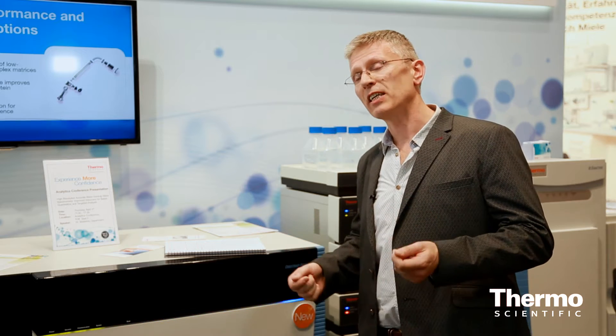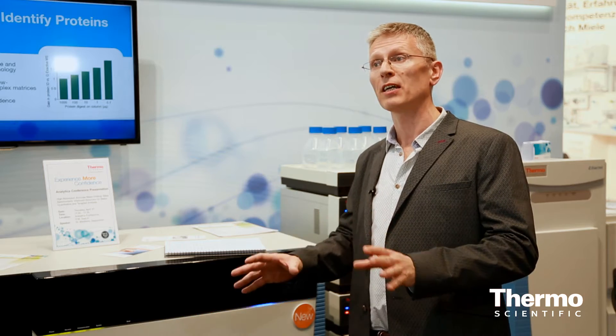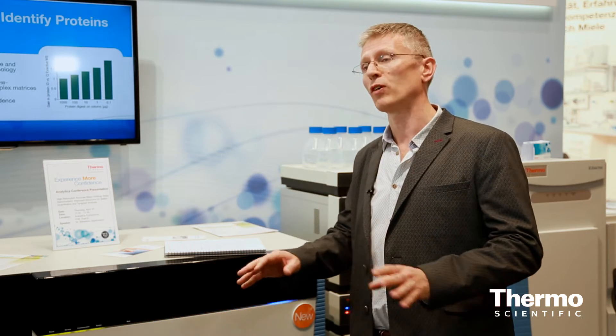It has ETD, HCD, and CID. This combination at any level of MSn allows amazing performance with totally different compounds.